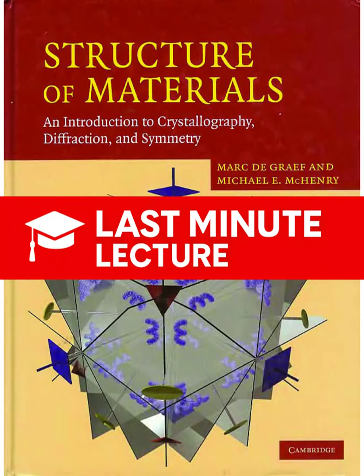He said, "In trying to think of some way in which diffraction effects with X-rays might be found, von Laue came to the realization that nature had provided, in a crystal, a diffraction grating exactly suited for that purpose." A built-in diffraction grating. I just love that idea that the regularity of the crystal lattice is precisely what we exploit. Okay, let's start with the tool itself, the X-ray.